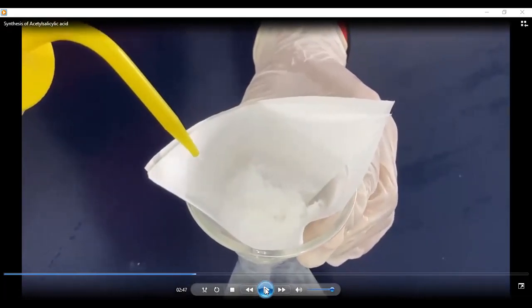Okay. Now, the purpose of adding cold water or cold distilled water to your mixture is to induce crystallization. Our aspirin is insoluble in cold water, so it can crystallize in cold temperatures.